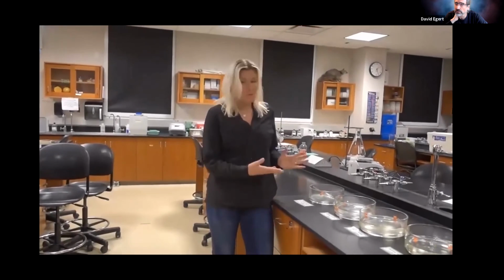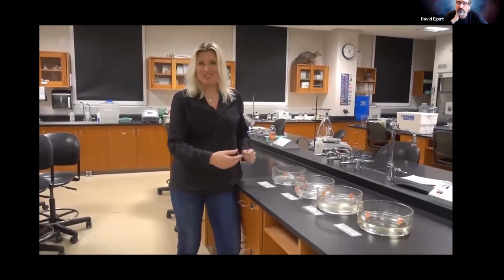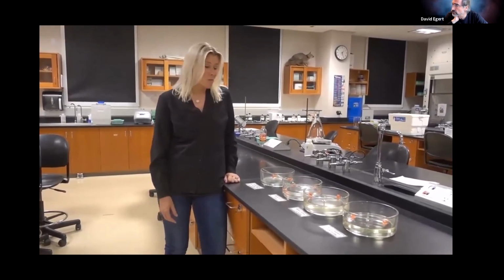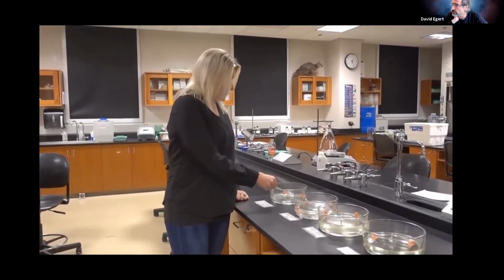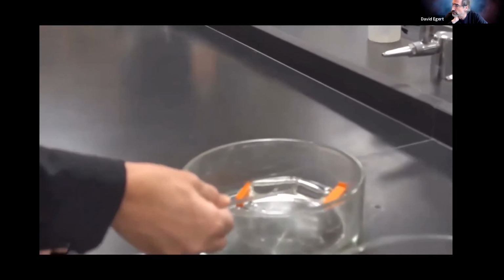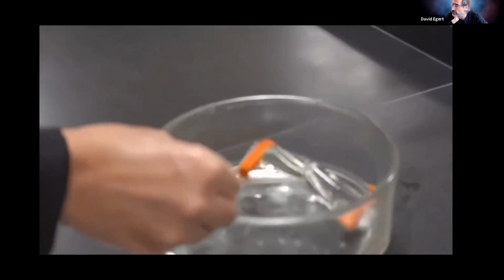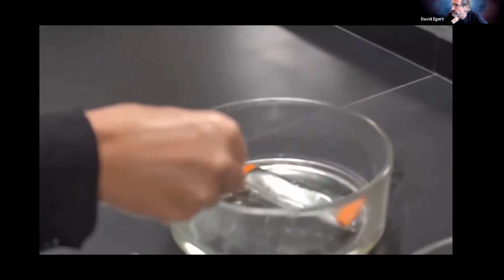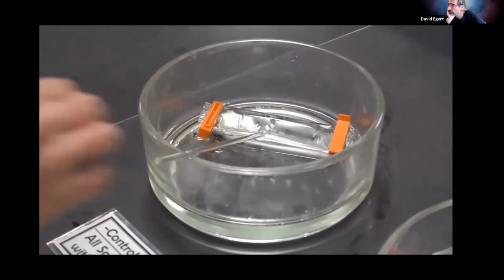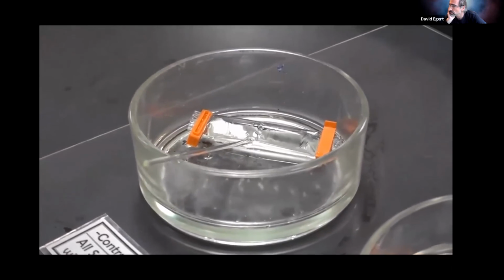All right, so we're back at our sausages made out of dialysis tube, and it's actually been an hour. Just to check on these, here's our control. You can see it's this consistency here. I can lift it and it bends a little, but we filled it with sucrose solution.